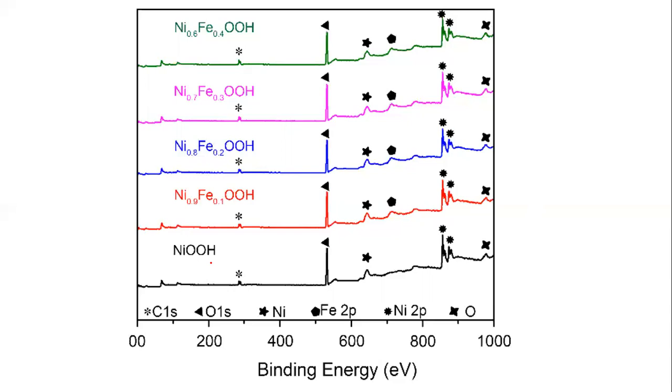For example, the first one, I can easily understand the shape of that sheet from SEM, scanning electron microscopy. The second one, I can understand how much is the length and what is the width and how much is the height. Then I can use atomic force microscopy for that. Okay, I'm not going into the detail, or you will get a little bit confused.